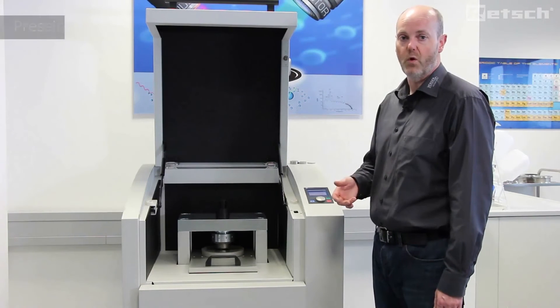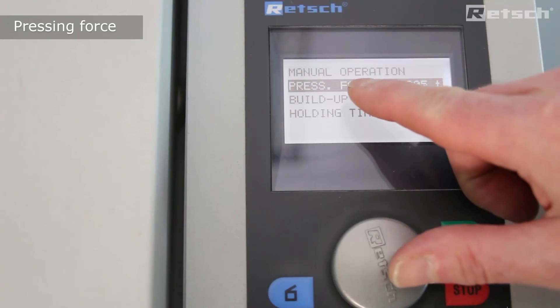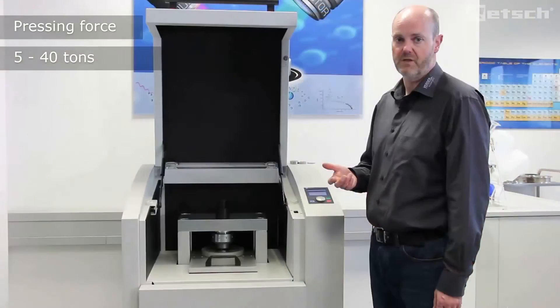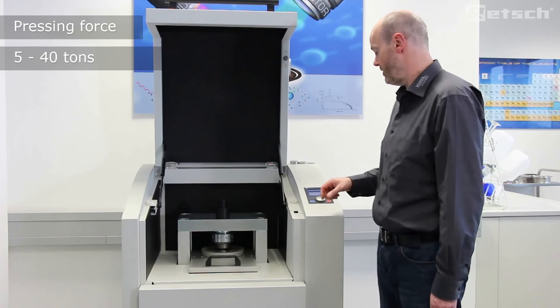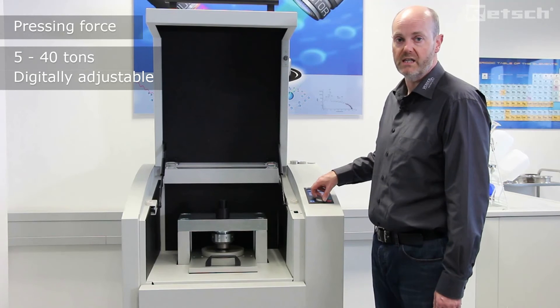The pressing force which the powders are subjected to is freely adjustable from a minimum of 5 tonnes up to a maximum of 40 tonnes, and can be adjusted digitally on the LCD display.